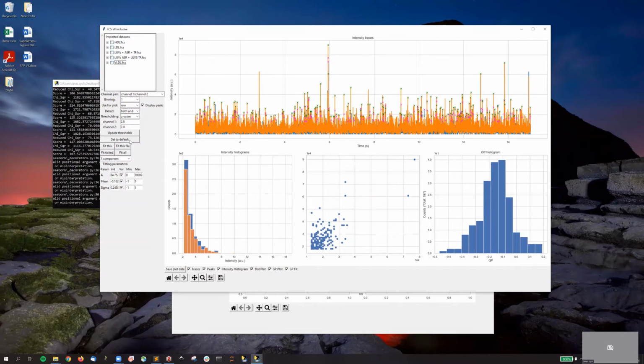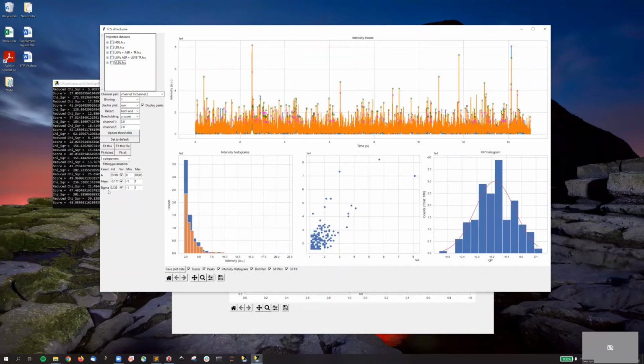And again, there is a threshold, and we would need to fit everything. And by fitting everything, we are pretty much fitting this histogram for every repetition, every file. In this histogram, we are getting, first of all, the mean of the GP distribution, and then sigma of the GP distribution. And of course, the magnitude of the GP distribution. So all parameters will be displayed over here: amplitude, mean, and sigma. And here the fitting will be shown.